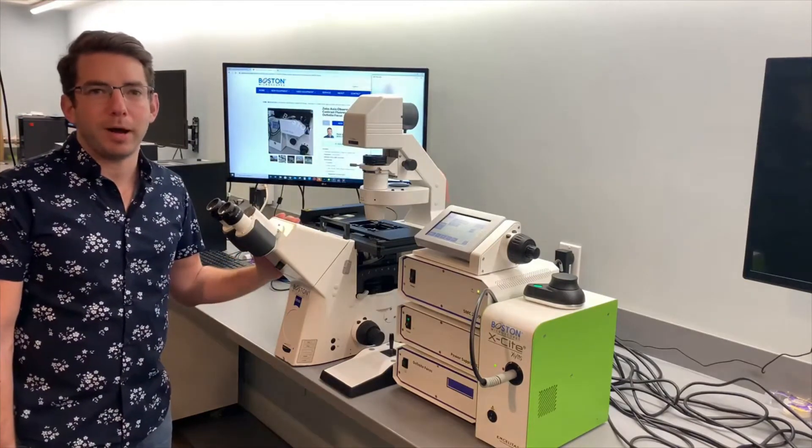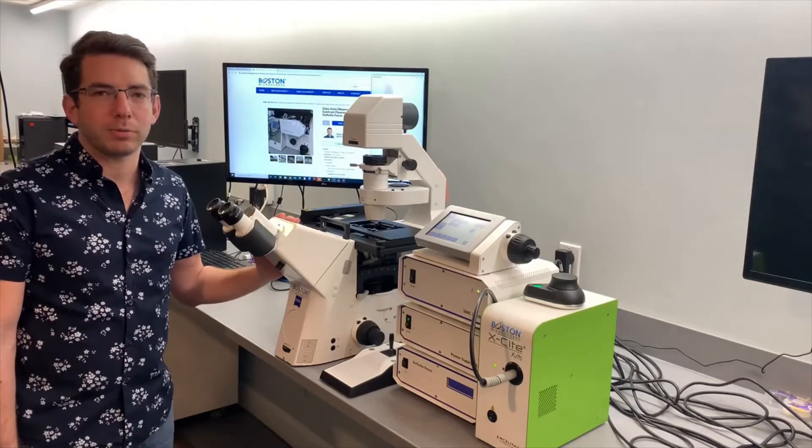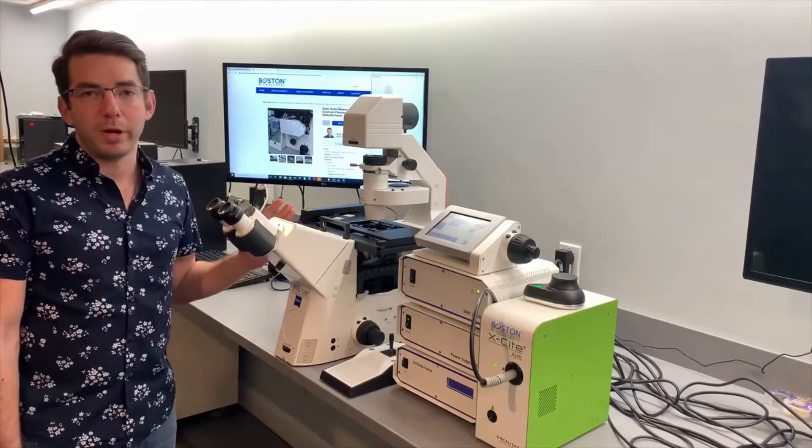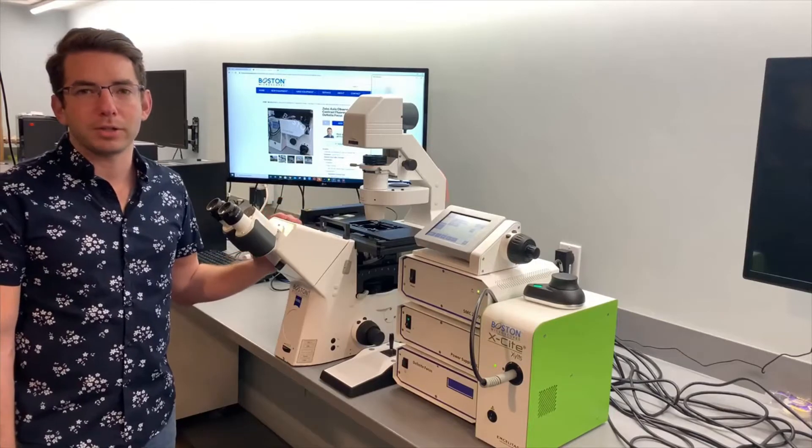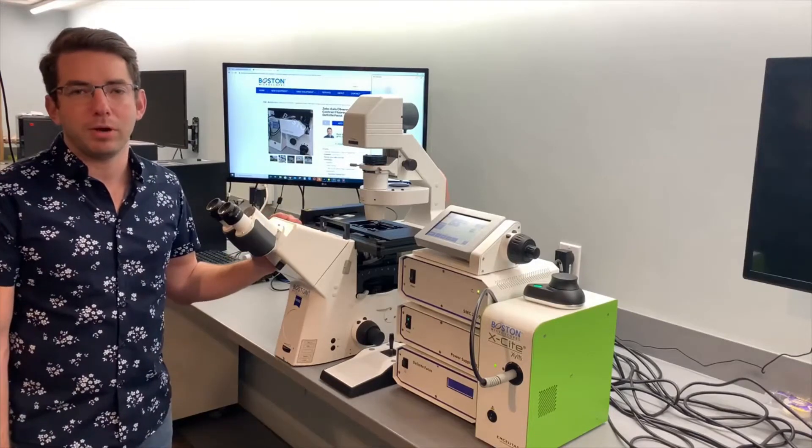Definite Focus is a great option for people that need to do long-term experiments and keep their sample in focus. The way it works is it shoots a grid through the objective onto the coverslip and keeps that grid always in focus.